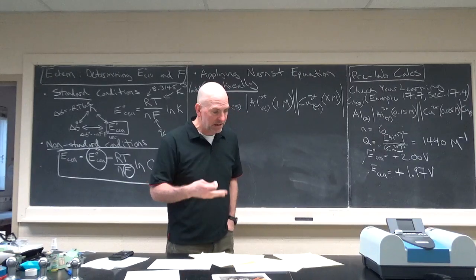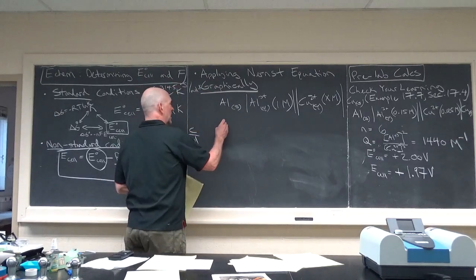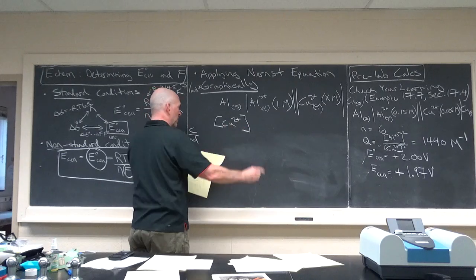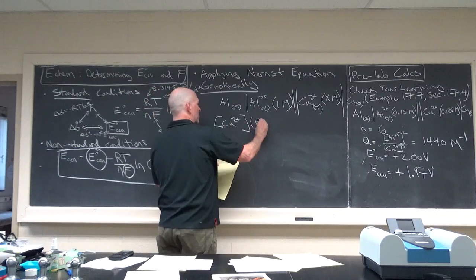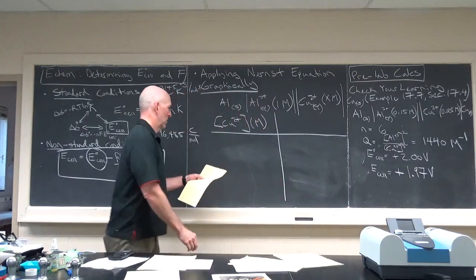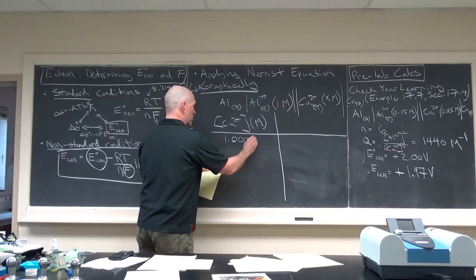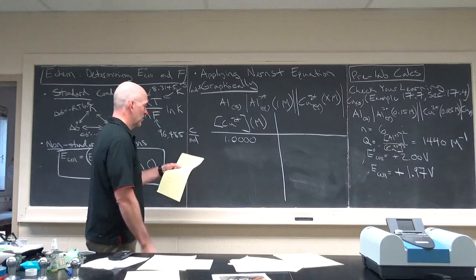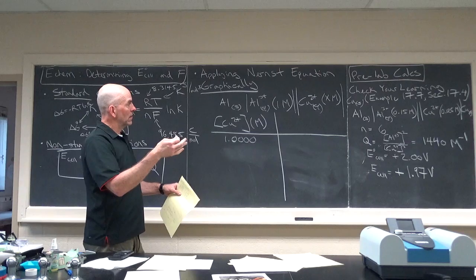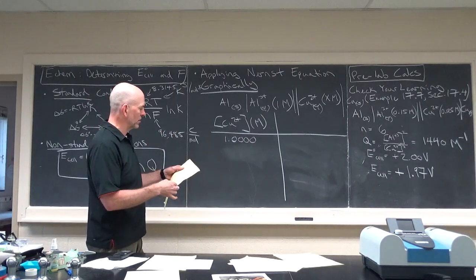And then what you're going to physically do in the lab, if I can find my data, is do a bunch of dilutions. I'm not sure this is exactly how it's done in your lab, but I took these out to a lot of decimal places. So what you're going to want to do with this data is put it on Excel and then make some graphs and do some calculations. I'm not going to explain everything, but this is a really good last lab to do.